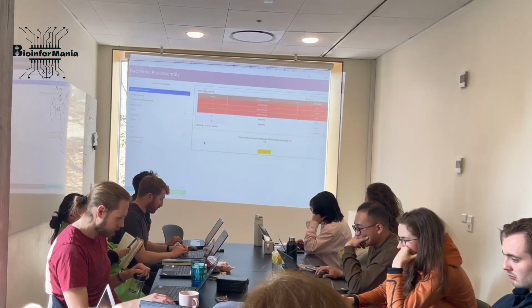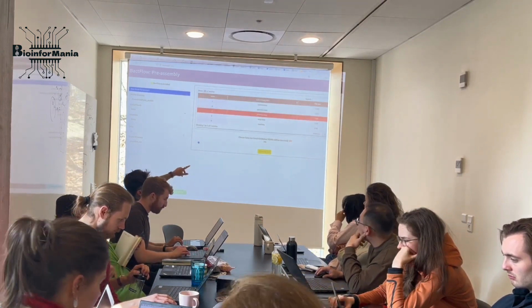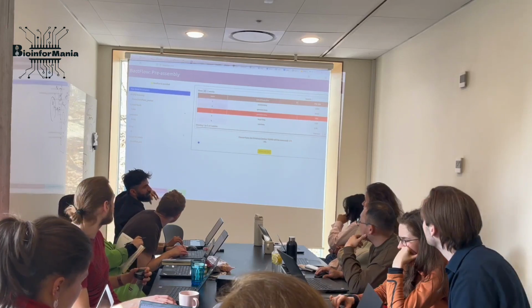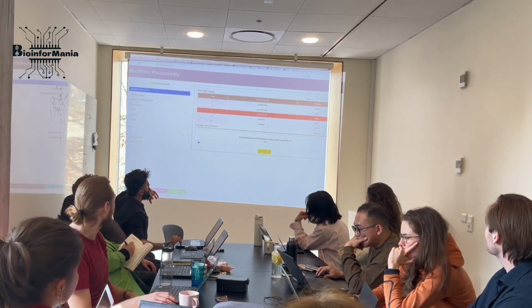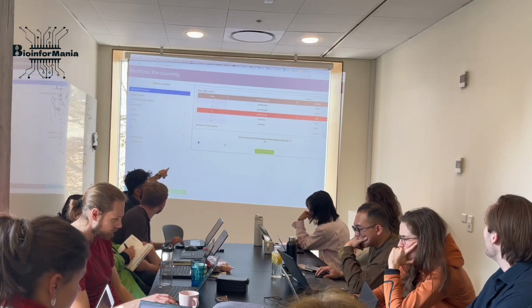So you can actually filter, like if you want to filter out, this is enough. Still, this is not enough, but this is quite good enough for assembly, depending on the genome, okay? So you might have some coverage here. So let's remove this one and update the list. So you can play with this, okay?